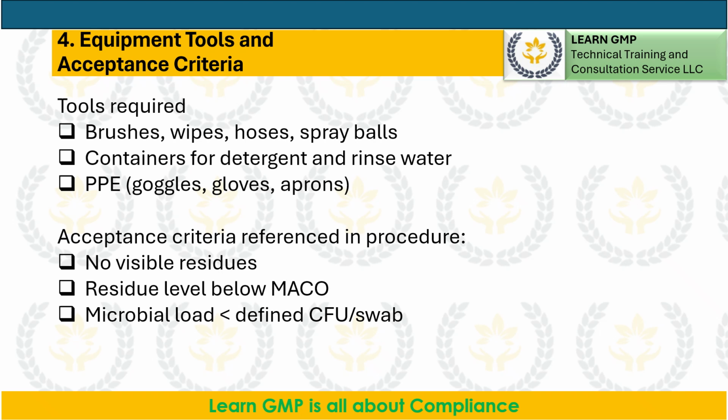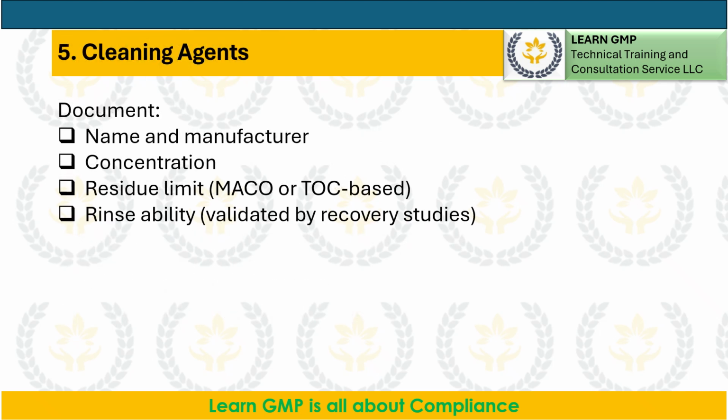Microbial load, defined CFU/swab. Cleaning agents: document the cleaning agent, name and manufacturer, concentration used. Residue limit, MACO or TOC based. Rinsability, validated by recovery studies.